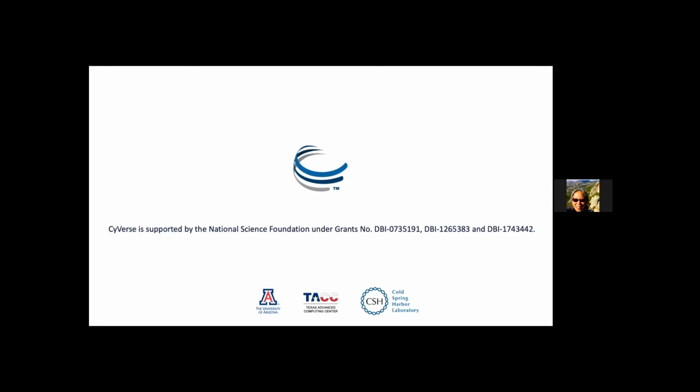Okay, and last question. Is there a way to identify the 2 SNPs, for example, on the Manhattan figure? Yes, and so in the R script that's there, I plot the Manhattan plot, but it also creates a text document that writes out each SNP and what its p-value is. So you can download that, open it, and sort it, and then it'll tell you based on the p-value what chromosome and what base pair that is. If you have a bunch of them, that might not be the best approach. However, in RStudio, you could plot it to have an interactive plot where you could hover over it and it'll tell you what that is. I did not do this in this particular case, but it can be done and modified fairly easily with the Plotly package. But the data is there in the output where you could identify exactly what that variant is.